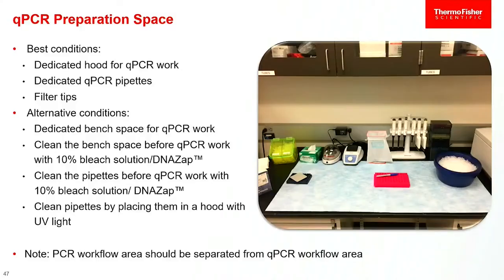I didn't put that there. Where did it come from? So we need to be effective and think critically about what we're doing and how we're doing it. We need to start in a very clean space. Because we have environmental systems that can hang on to these molecules, sometimes working in a PCR hood is a good option if it's available. That way, it's a space that you can shine a light in and clean it and degrade all of the sample before we start. And then it's clean for the next person.